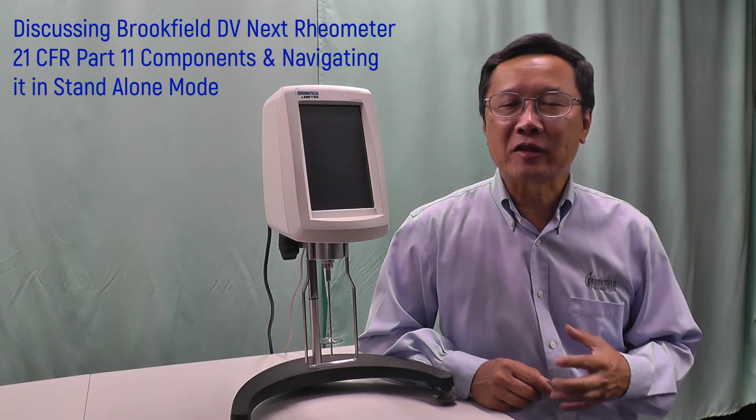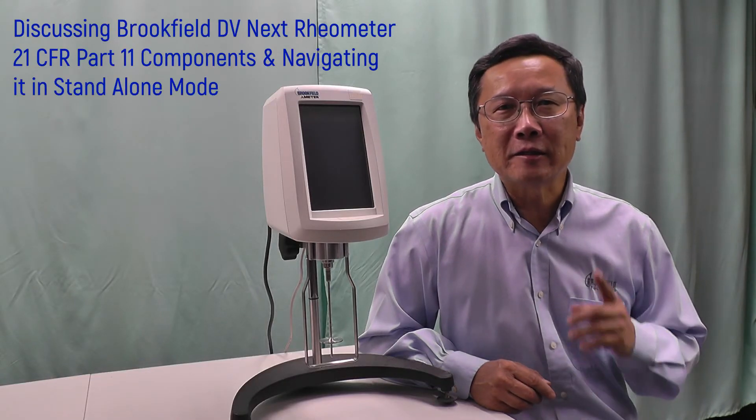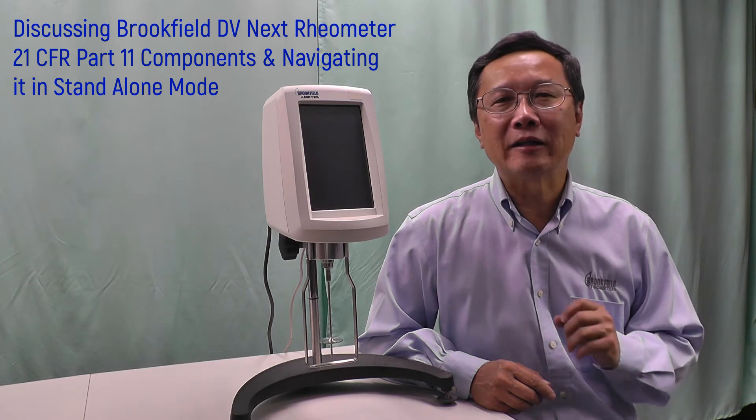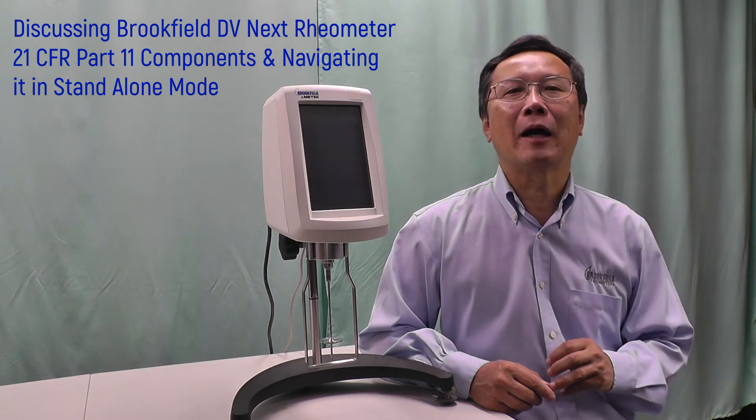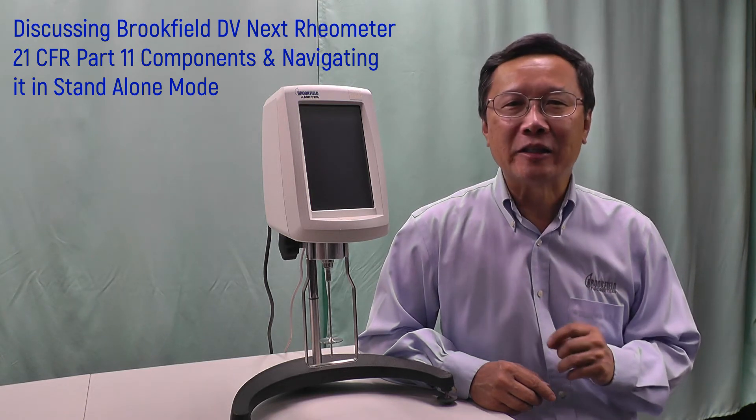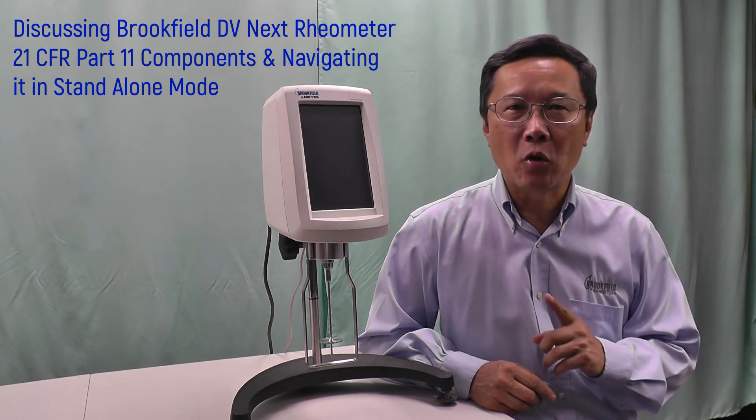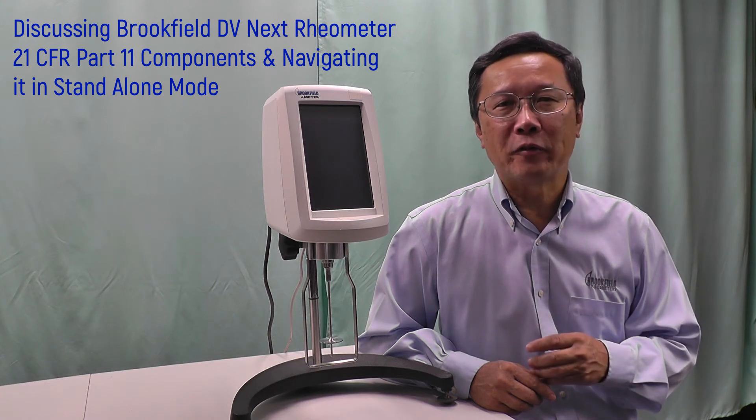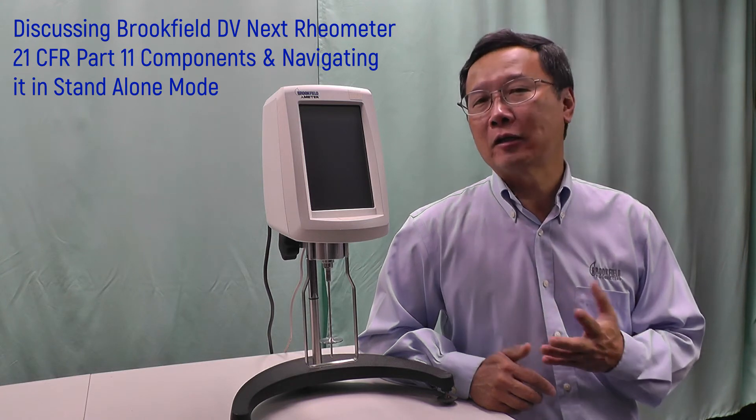The Brookfield DVNEX Viscometer is 21 CFR Part 11 compliant, which can be used either in external mode with RheoCal-T software or in standalone mode. In this video, I will discuss the 21 CFR Part 11 compliance components available in DVNEX Viscometer running in standalone mode.